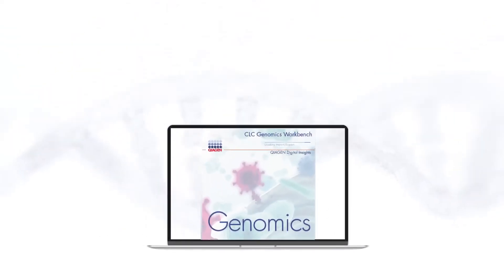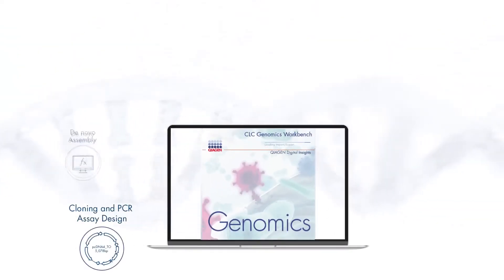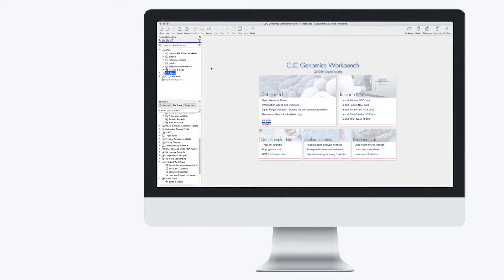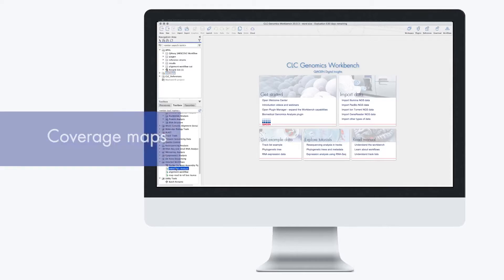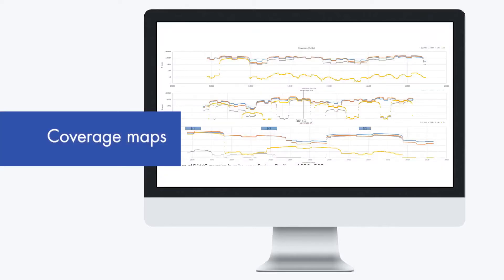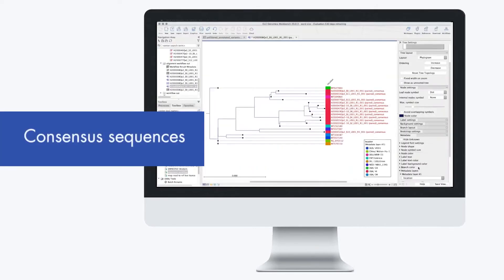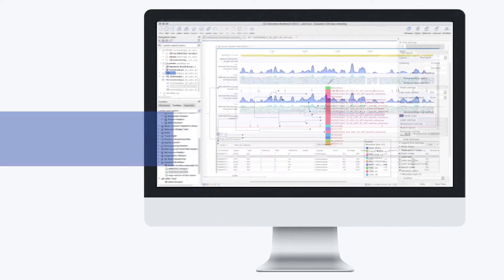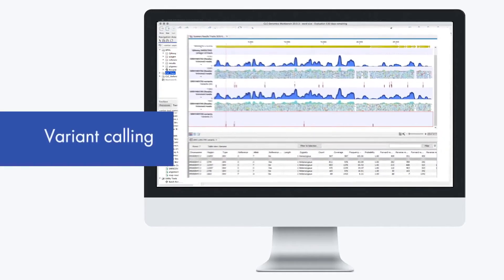With the QIAGEN CLC Genomics Workbench, we take your reads, we do QC and trimming of those reads, and then map them to a reference genome. From there we do a number of analyses including coverage maps, consensus sequences for phylogenetic analyses, and of course variant calling as well.